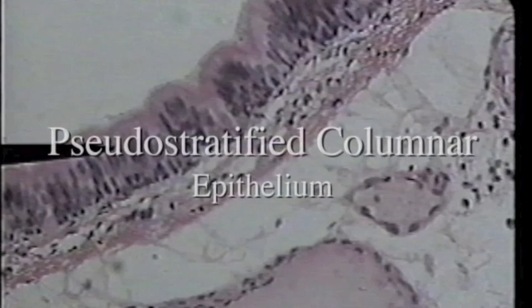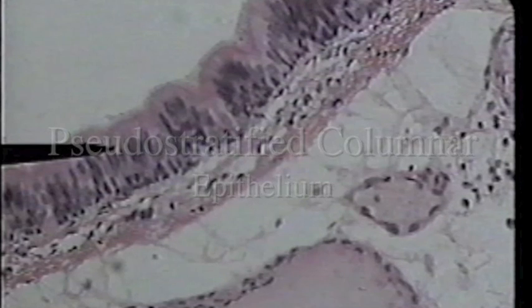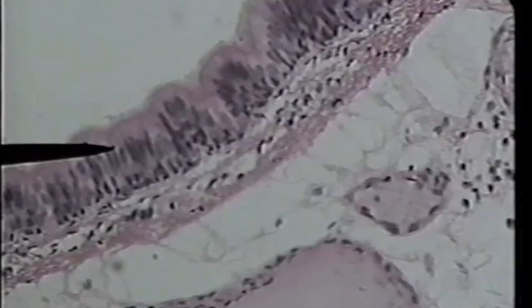We are looking at a slide of pseudo-stratified columnar epithelium on high power. The tip of the pointer is showing the dark nuclei. As you look at this slide, you'll notice that the most apical cells, or the cells nearest the lumen, are columnar in shape. You can clearly see the pink cytoplasmic region nearest the lumen — that is how we can tell these cells are columnar. At first glance, it appears that there are multiple layers of cells, however each of these cells is actually in contact with the basement lamina.